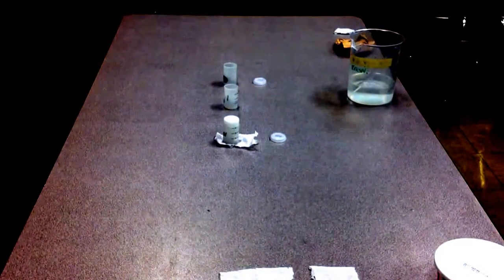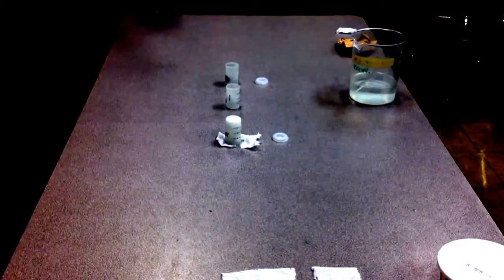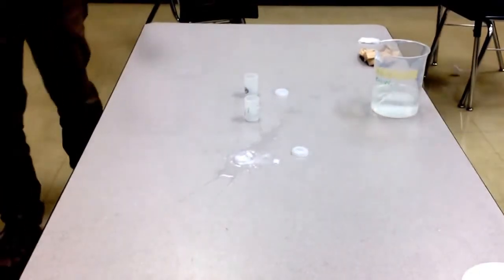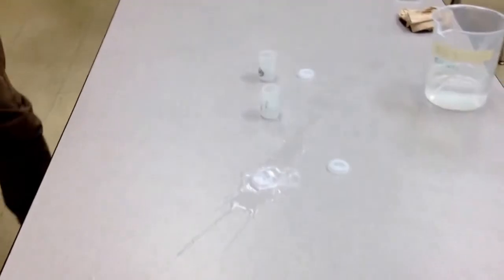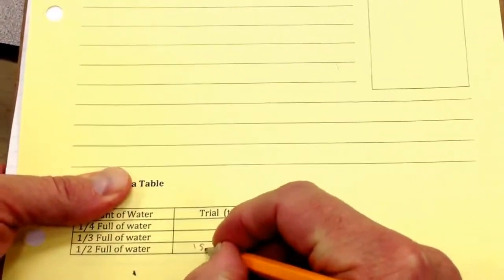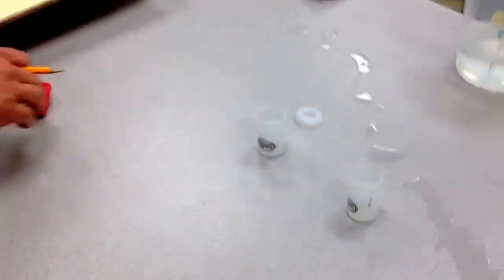7 seconds. Wait for it. Good. Nice. 15.02 seconds. So I'm going to write that on my data table right here. That was the half full. 15.02. Okay. Now we'll do the next one.